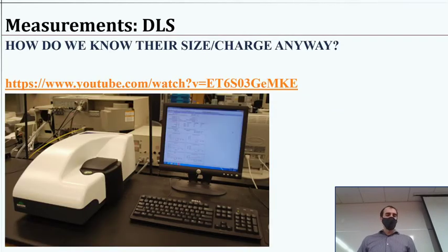This is just a random picture from the web, but I could have taken one from my lab because I ended up acquiring one of these instruments. This is a photo of a Malvern Zetasizer. There are other instruments like it from other companies, but they are one of the industry standards, and they have a nice little video that I want to share to introduce how we can use what we call dynamic light scattering to observe particle size distribution.